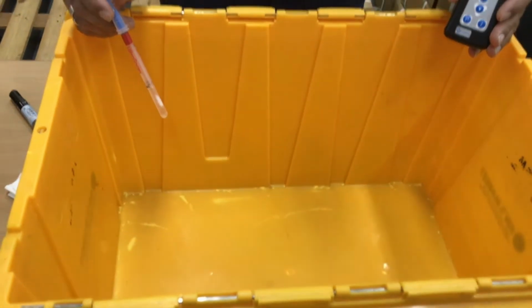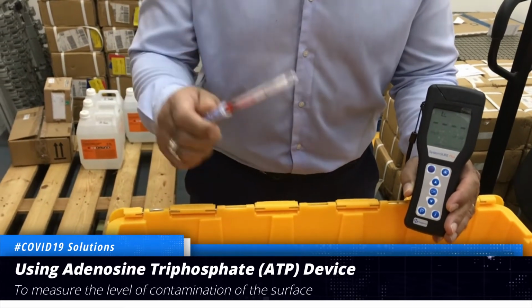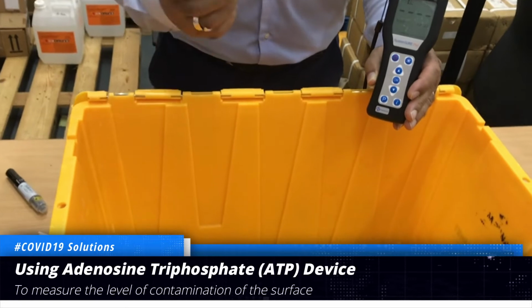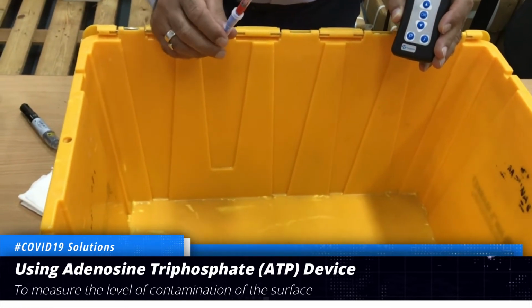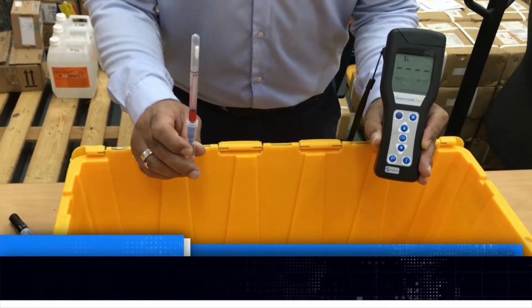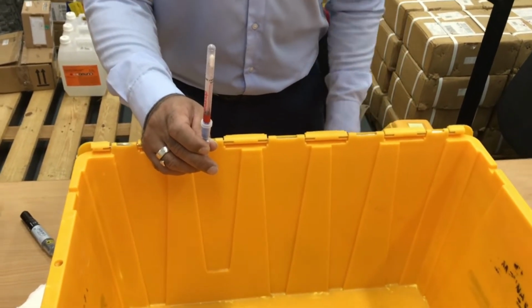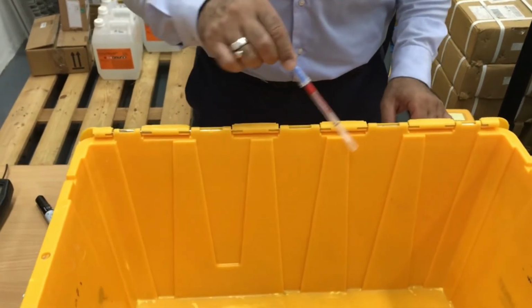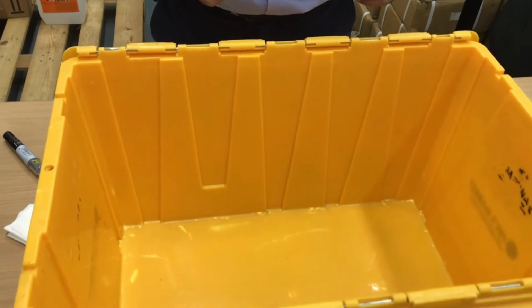This container is used for meat transport, fresh meat and frozen meat in vacuum packs. But with this test, we will show you that even though the container was packed with vacuum-packed meat, there will be contamination. How high the contamination is will be measured with the ATP, the adenosine triphosphate meter. This will measure the living proteins which are still on the surface of this box.